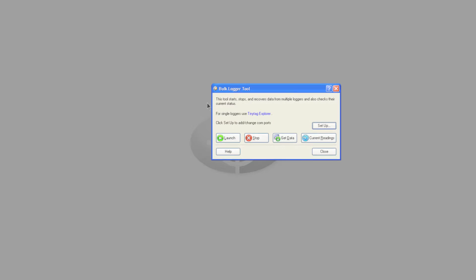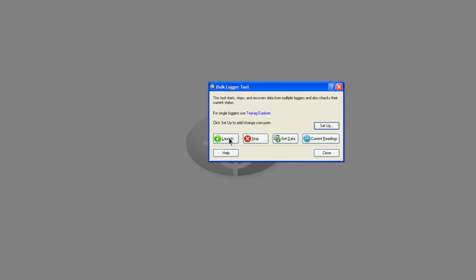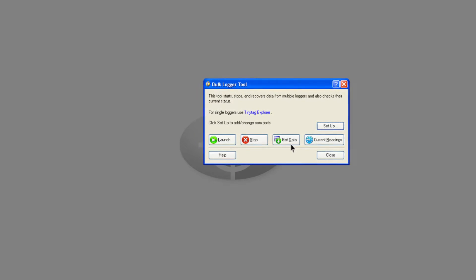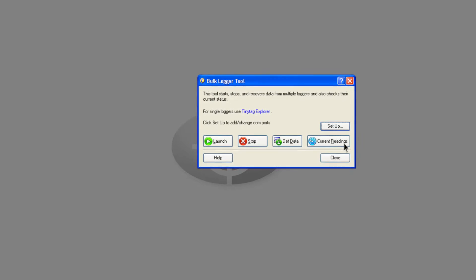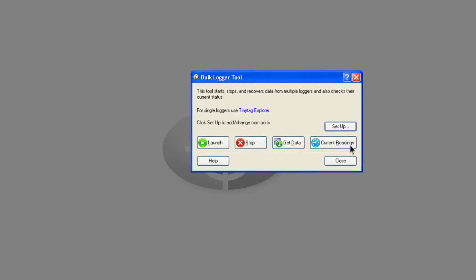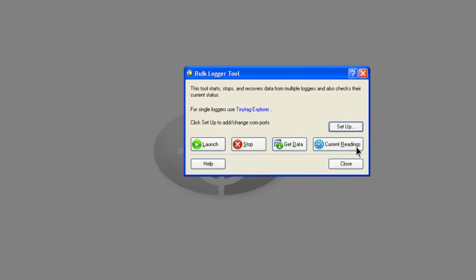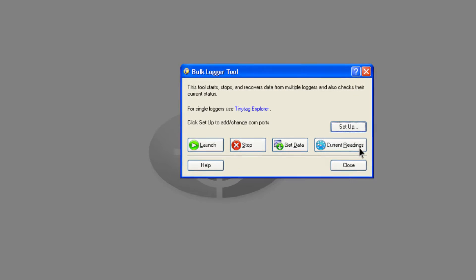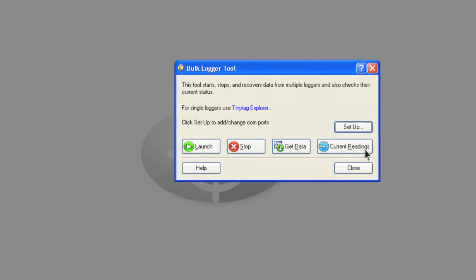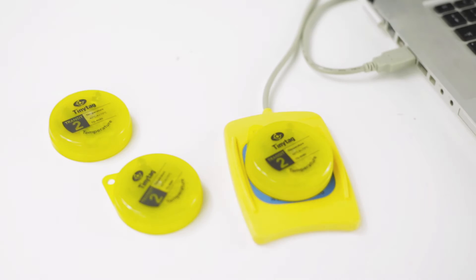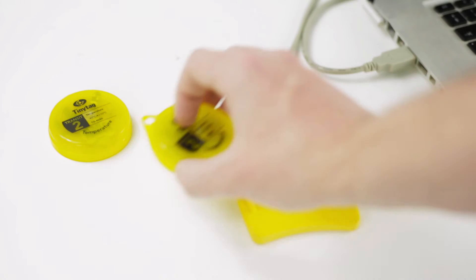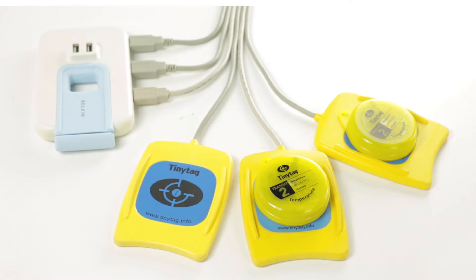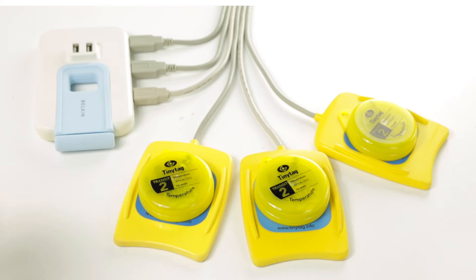Other features of TinyTag Explorer include the bulk logger tool to start, stop, get data from and view the current readings of multiple data loggers at the same time. This can significantly reduce the time needed to manage multiple loggers. The first data logger is configured and then successive units are programmed with the same settings. The configuration only has to be entered once. Loggers can be programmed or offloaded in turn using a cable or inductive pad.